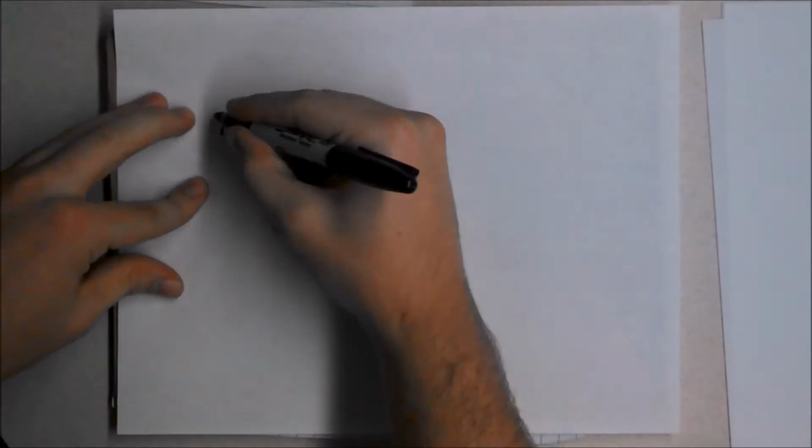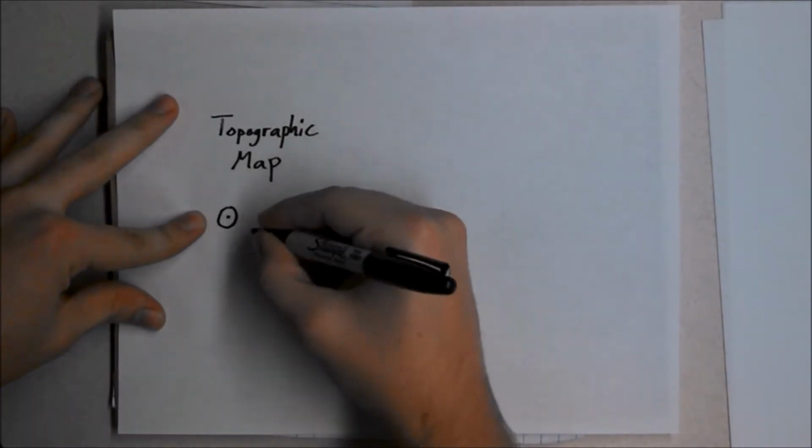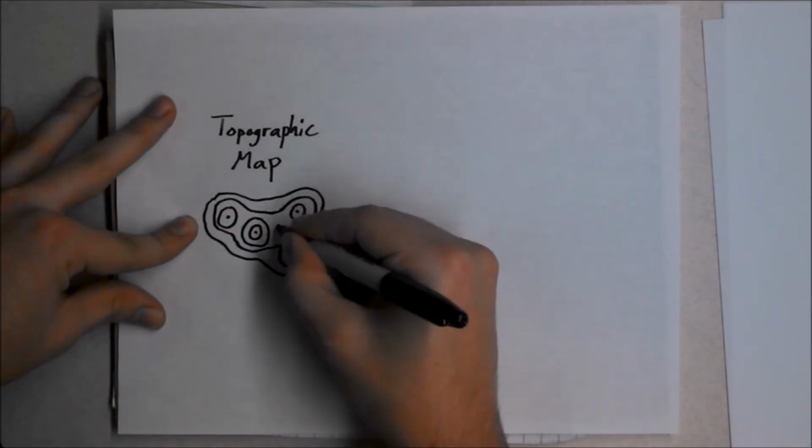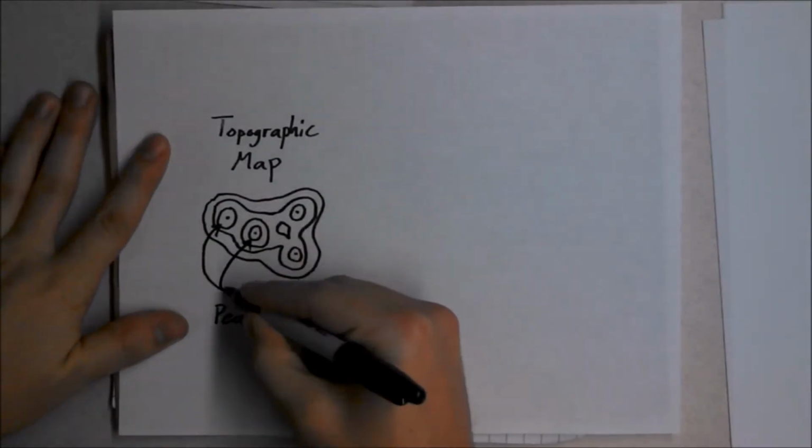This would give you something called a topographic map, where you could draw lines of similar altitude over a two-dimensional region that is the mountain range. You could use this to find the peaks of the mountain.